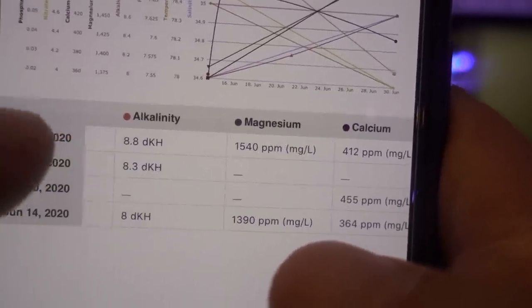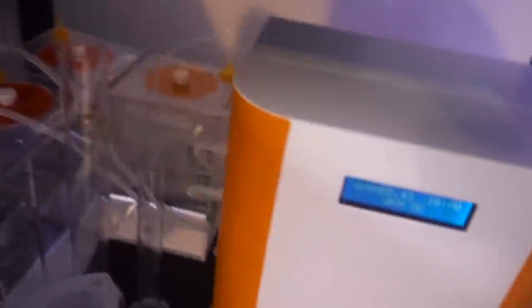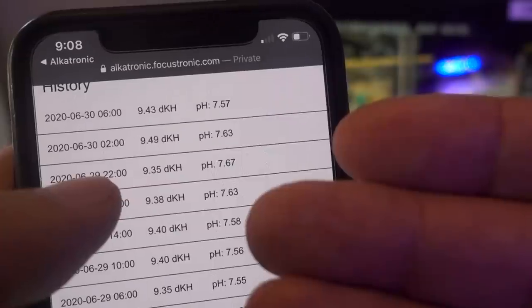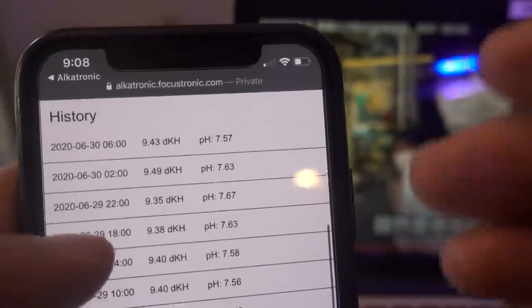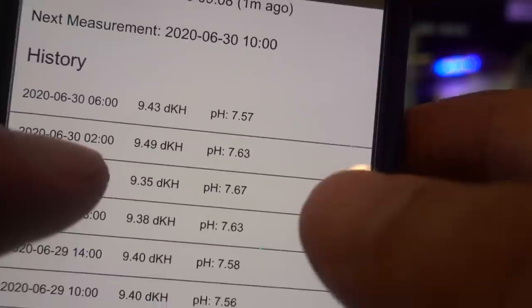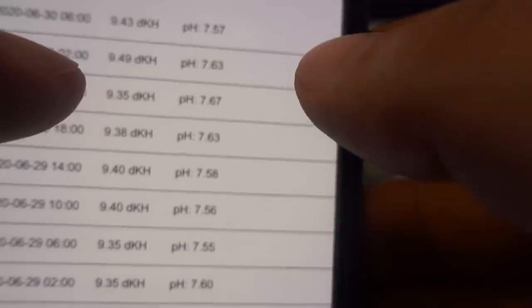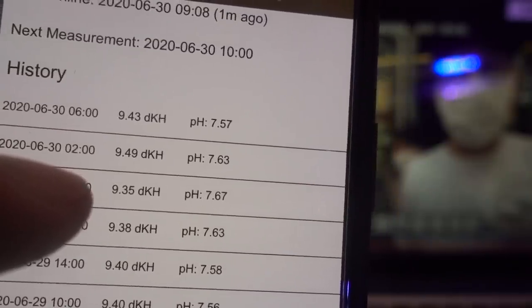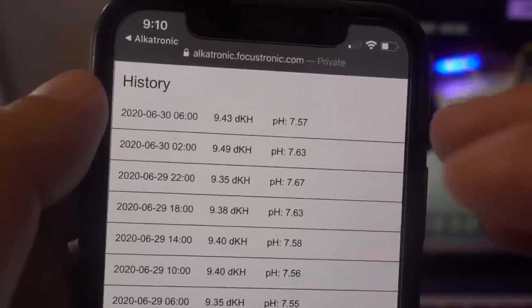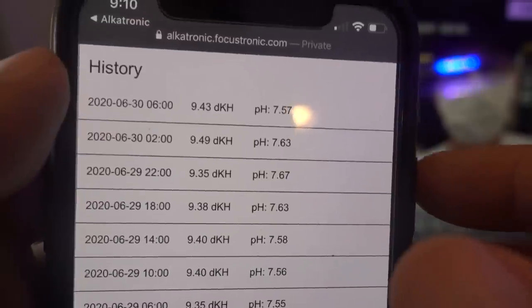In terms of alkalinity, I have a lot of confidence in the HANA alkalinity checker, so I'm using HANA's value of 8.8. On the Alcatronic, it's showing 9.43 at the moment. Looking at the trend line, the trending is actually okay — consistency is there within the test itself, meaning within Alcatronic the test is consistent. But between Alcatronic and HANA, there's a discrepancy. I wonder if it has something to do with the lower pH value, because I really don't think my tank is sitting at 7.57. It could be 7.8-ish that the GHL Mini is showing. As long as the test within a test kit is consistent and repeatable, I feel like it is okay.